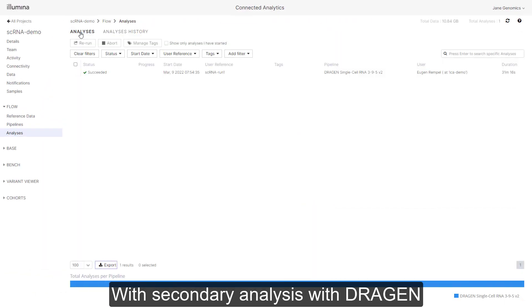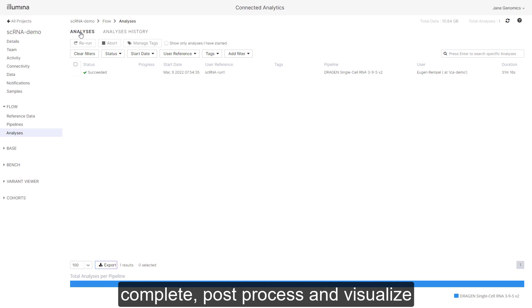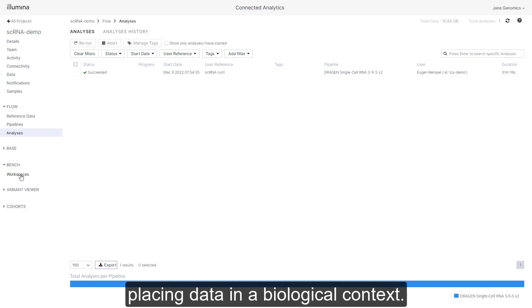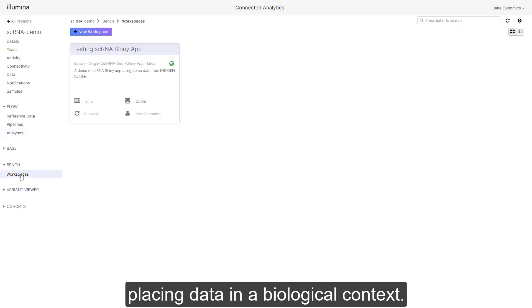With secondary analysis with DRAGEN complete, post-process and visualize results in an interactive manner to begin placing data in a biological context.